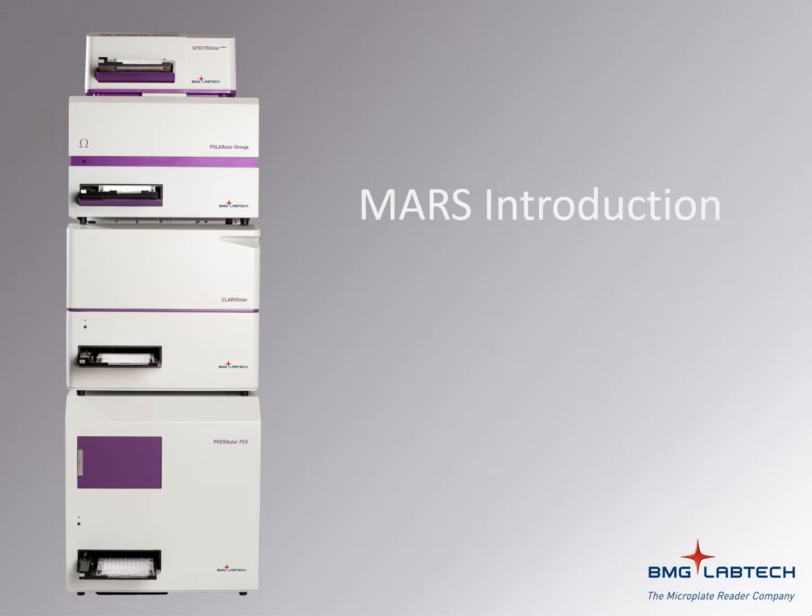BMG's Mars data analysis software can be a valuable tool that saves your lab time and effort. It is our hope that if you understand its capabilities, you will use them and see the benefits. This video will cover several ways to open Mars and introduce the basic layout and tools available in this software.